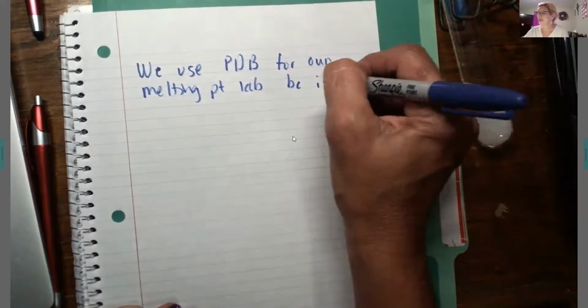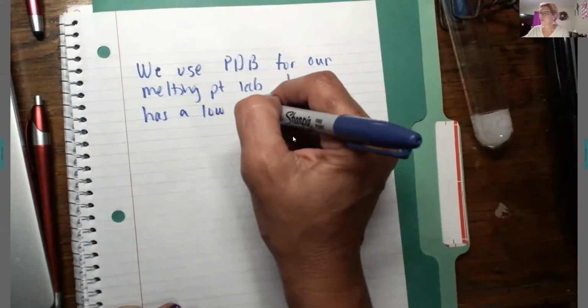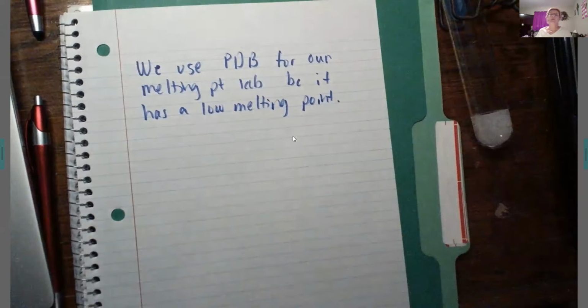Because it has a low melting point. And you can look that up on the internet. You can look it up on Google. What is the melting point for paradichlorobenzene?